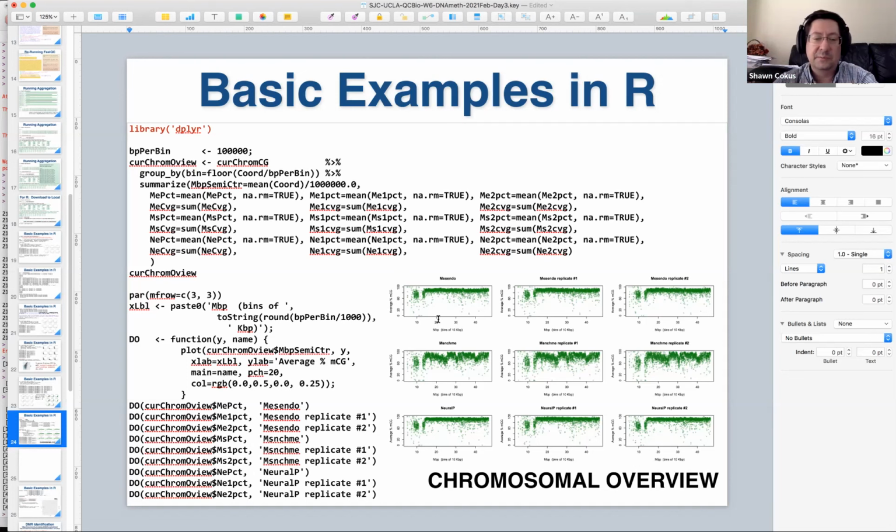It would be workable, but to make a publication, we want megabase pairs or something, not bin numbers. So we introduce a new column, megabase pairs in kind of the center of the bin. We'll let that center actually be a little bit weighted in the sense that if all the data comes from the left side of the bin, we'll have it near the middle of the left side of the bin. And so we'll let the data coordinates sort of pull us towards one end or the other of the bin. So we can actually just do that by summarizing in the mini table.